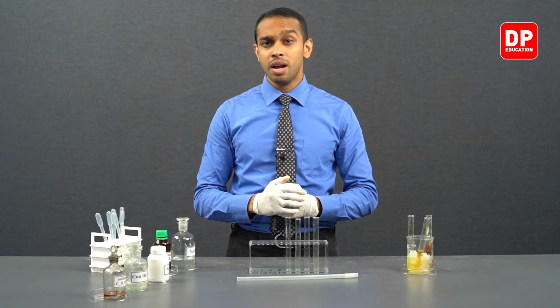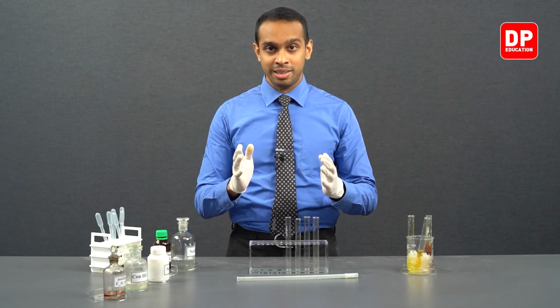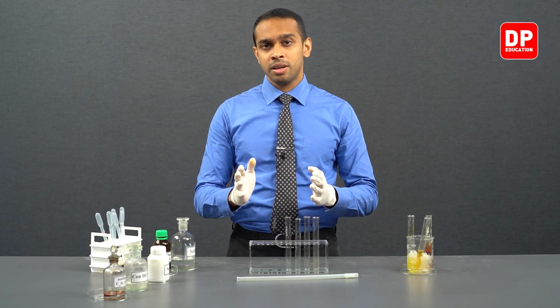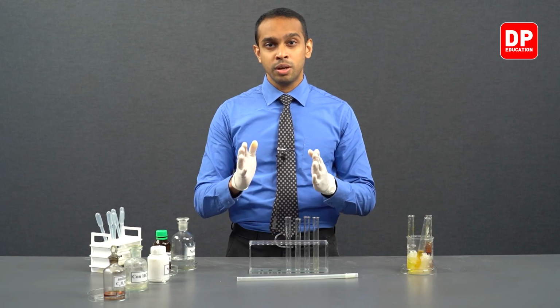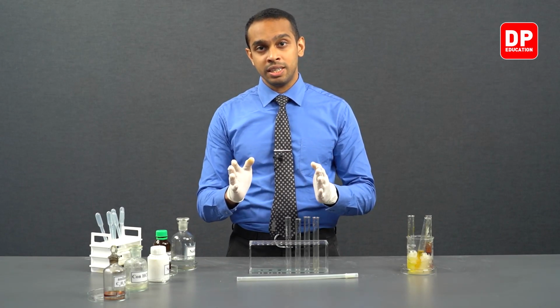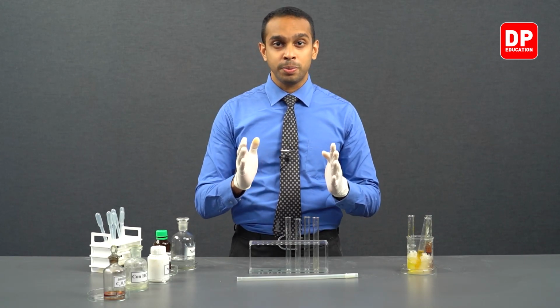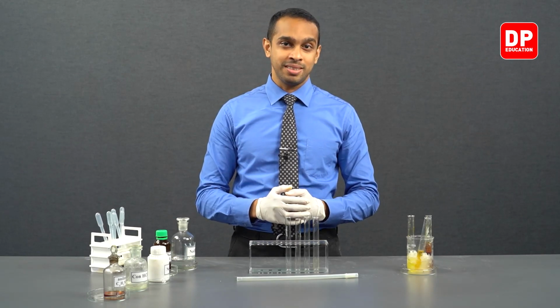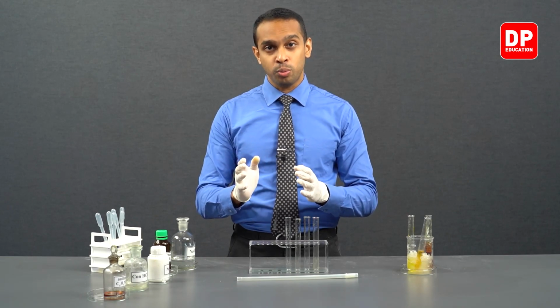Now, afterwards, we added bromine water to aniline. Upon addition of bromine water, the color of bromine water, in our case, the color was pale yellow-brown color, and when we added aniline to it, we saw the color of bromine water disappeared while forming a white color precipitate, which was 2,4,6-tribromoaniline.